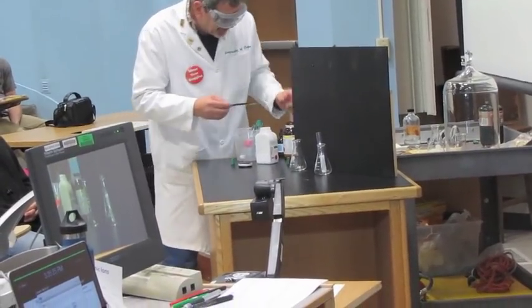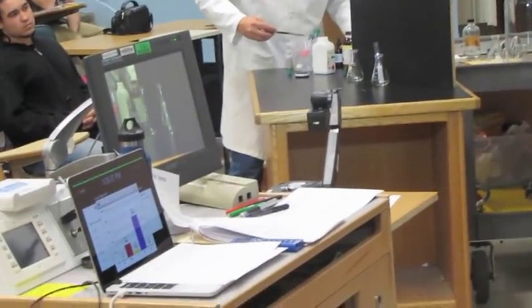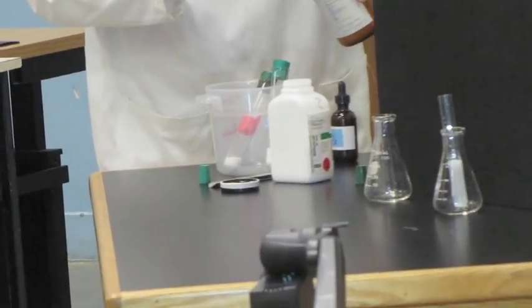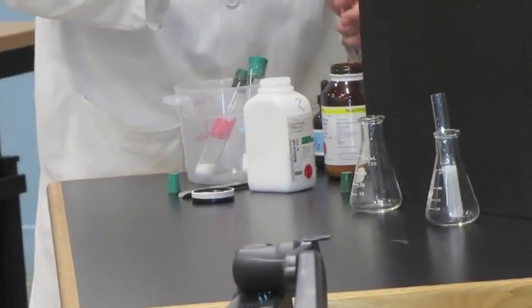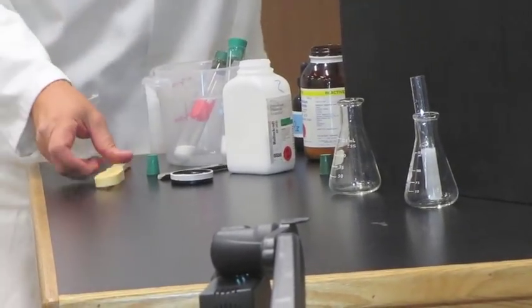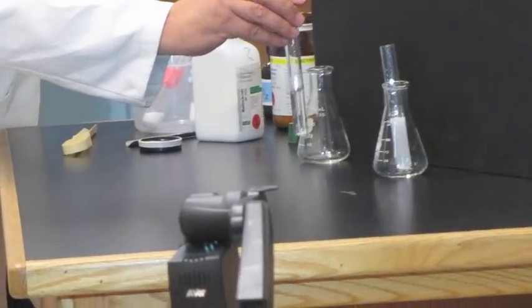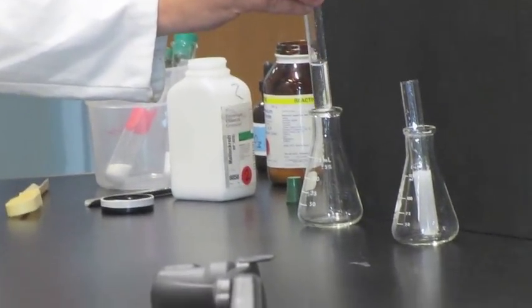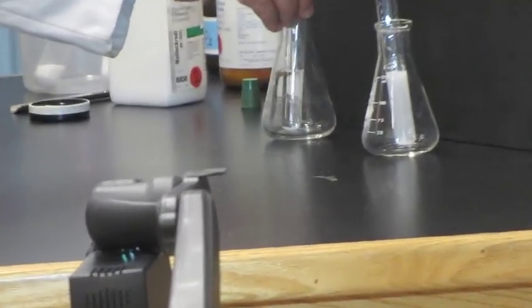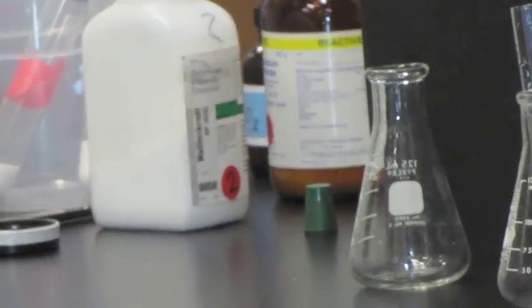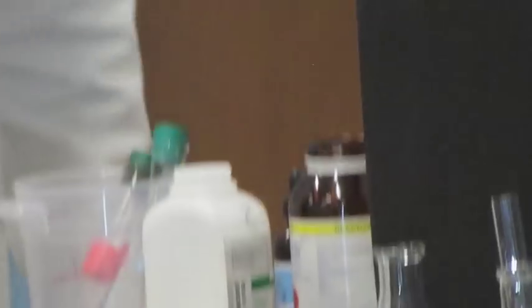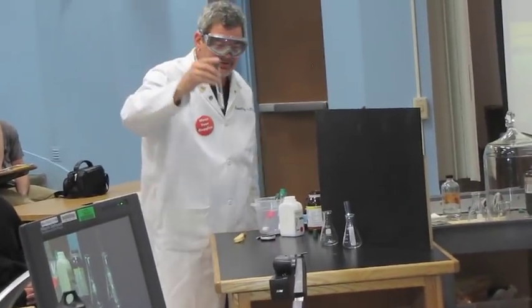Now I'm going to take some water again. This time I'm going to put some potassium chlorate in it. Take a carefully measured quantity. Put it in there. Shake it around. See if it dissolves. And I notice it doesn't quite dissolve as well. This is a crappy projector. A little bit left on the bottom. I don't know if you can see it. It's dissolving, just not quite as quickly.